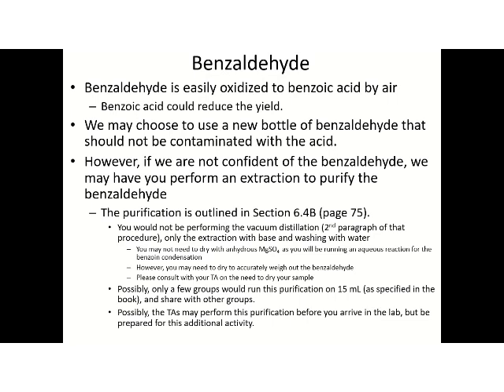You may not need to dry with anhydrous magnesium sulfate, since you will be running an aqueous reaction for the benzoin condensation. However, you may need to dry to accurately weigh the benzaldehyde. That's very important that you understand.